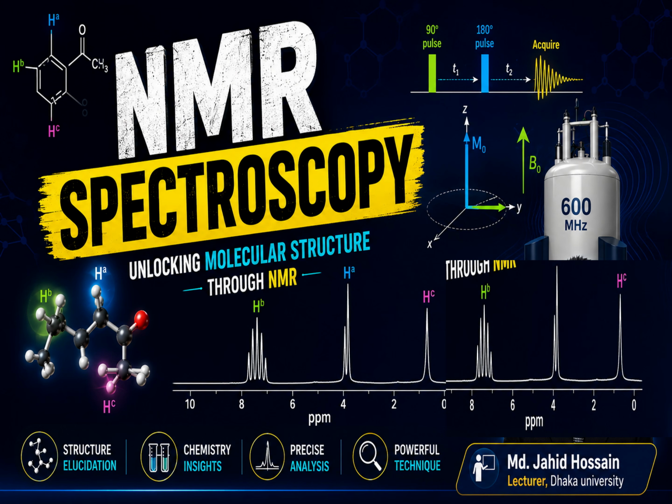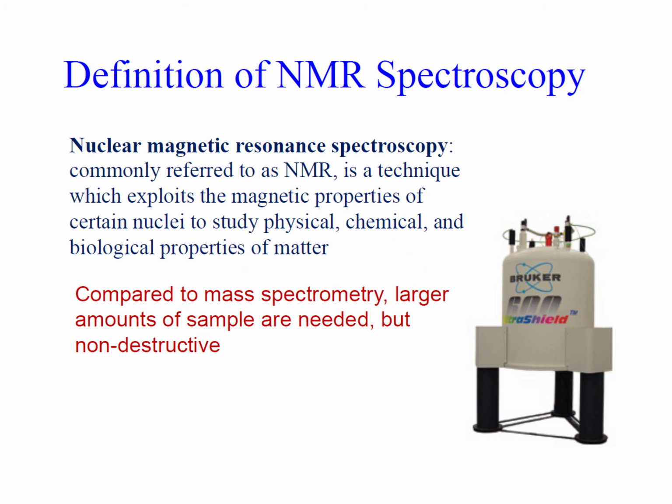Assalamu alaikum everyone. In today's video lecture, we'll learn about NMR spectroscopy, its application, and structural elucidation. So let's start. What is NMR spectroscopy?